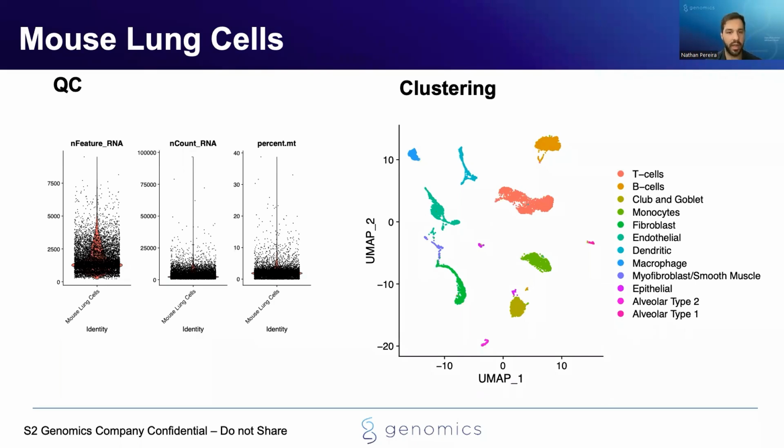In the cell data, we do see all the expected cell types again: endothelial, epithelial, alveolar type cells, muscle cells. You can see higher feature count RNA as expected, but what you do see is an increased percentage of T cells and B cells, and again, that's going to be due to the ease of isolating immune cell types over the more structurally embedded endothelial and epithelial type cells.